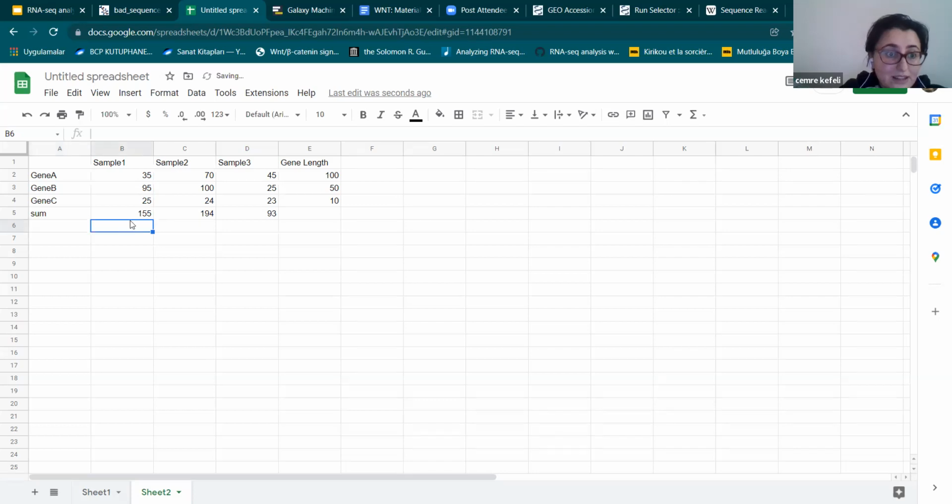I will just divide these numbers by 500. Okay, and now we go here. Yes, now we have the per million scale.